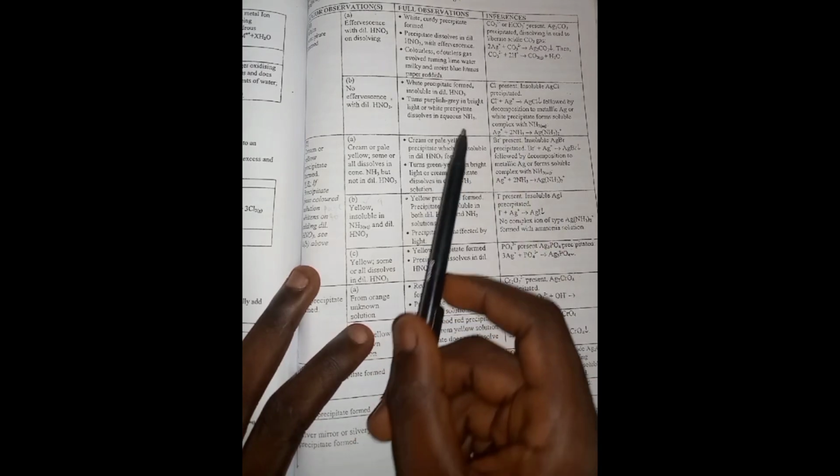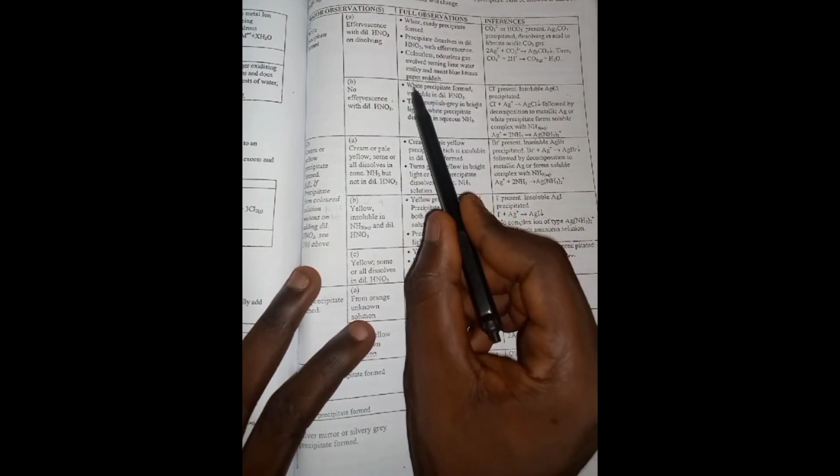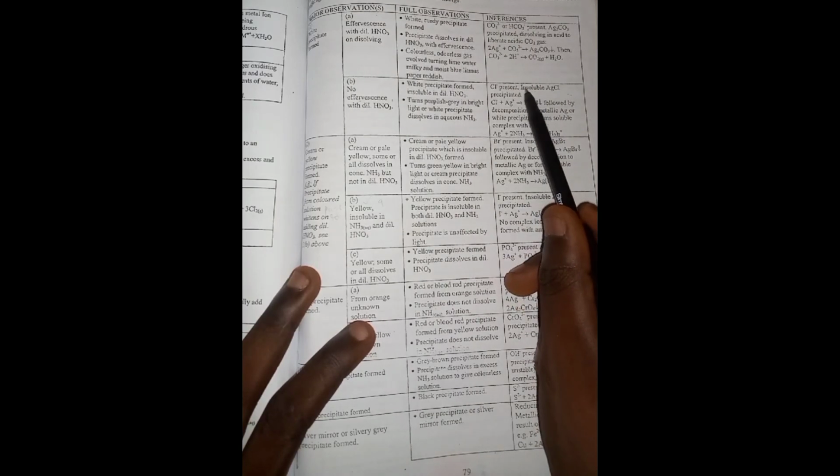But if you don't want to copy that for ammonia, no problem, since you were adding excess nitric acid. If you choose not to copy that for ammonia, no problem. If you want to copy that for ammonia, fine. But since you added excess nitric acid, I suggest you copy: white precipitate formed insoluble in dilute nitric acid. Then you come under the inferences: chloride ions present, insoluble silver chloride precipitate. Then you write down the equation. Then yes, good. So guys, this is what you're going to have.